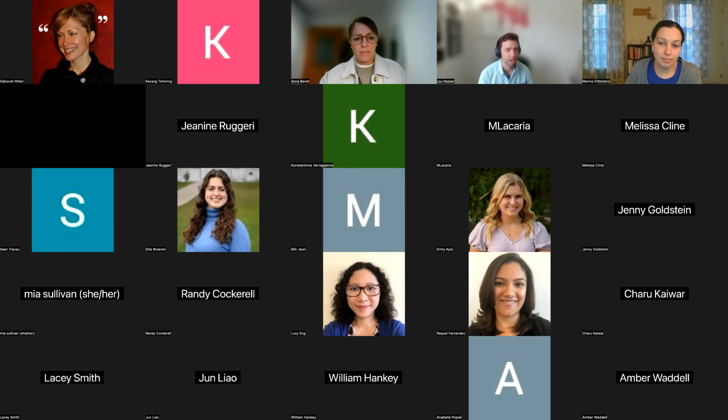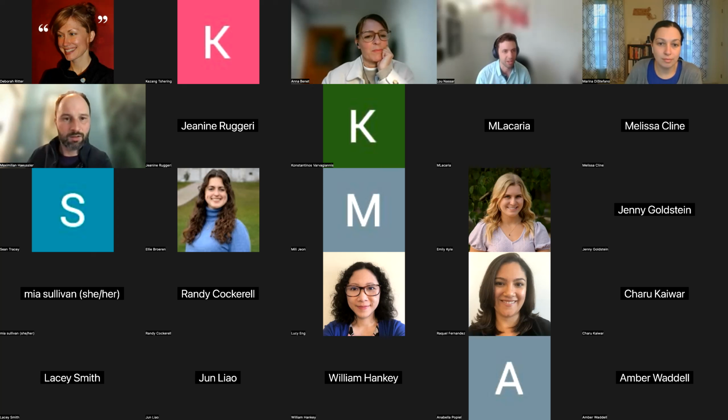Great. Regarding the searching, Anna covered it pretty well. If you want to search by assigned codes, it's a little ambiguous. We could do that, but searching for specific variants is probably going to be the best. We can filter specific tracks so that if you're only interested in certain assigned codes, those can display, and that's something, again, we can follow up on.